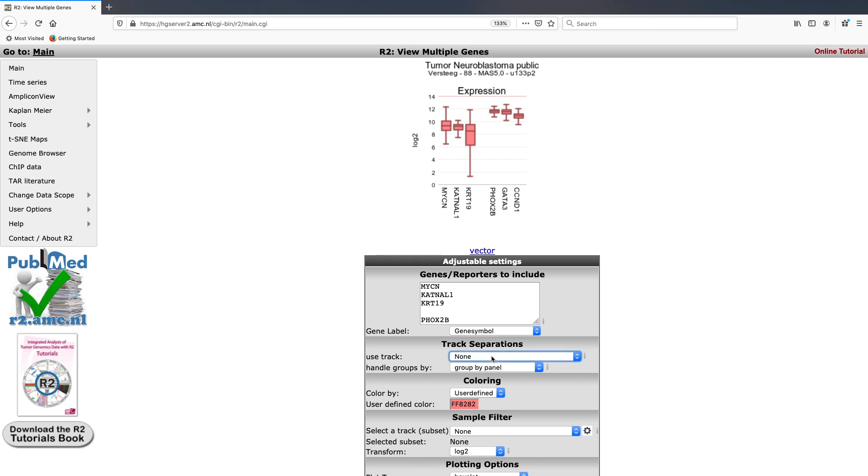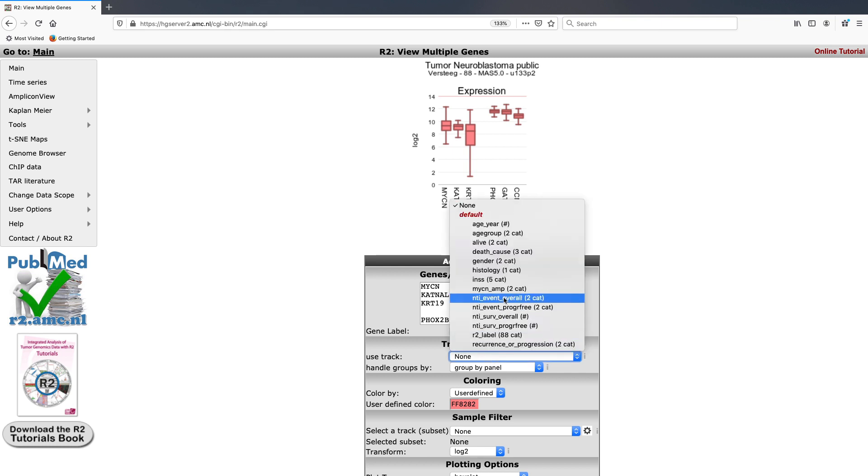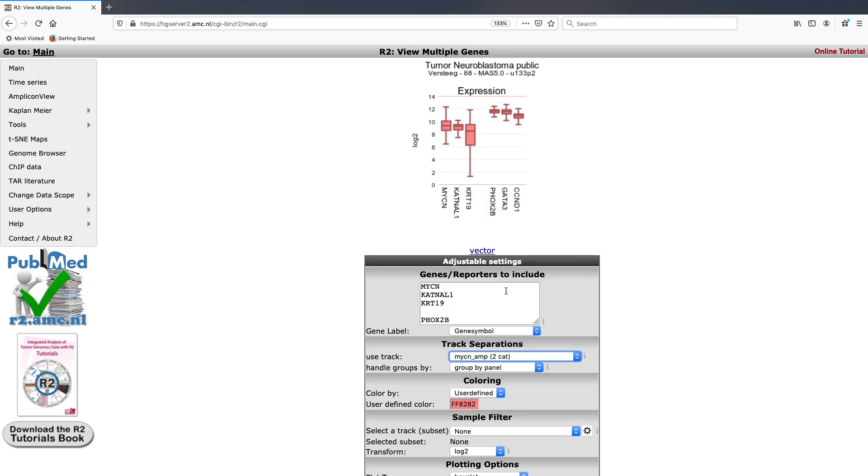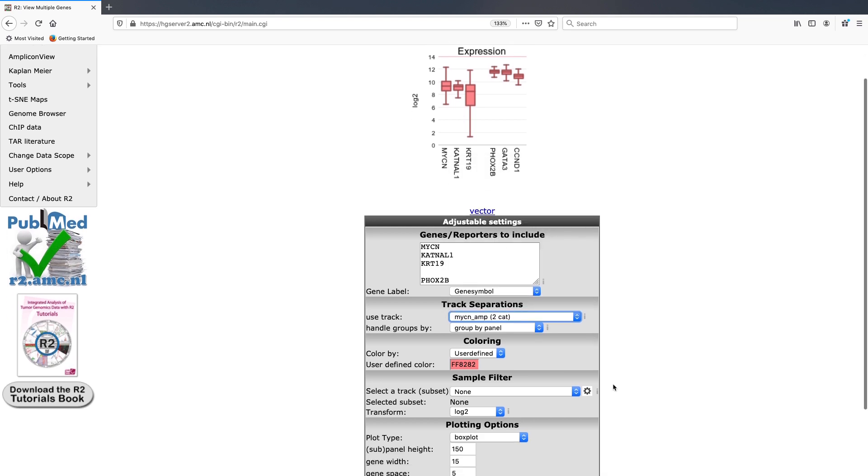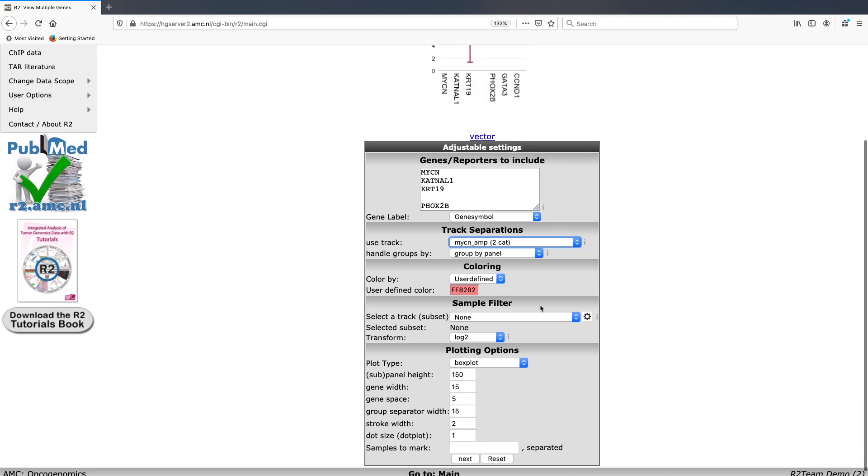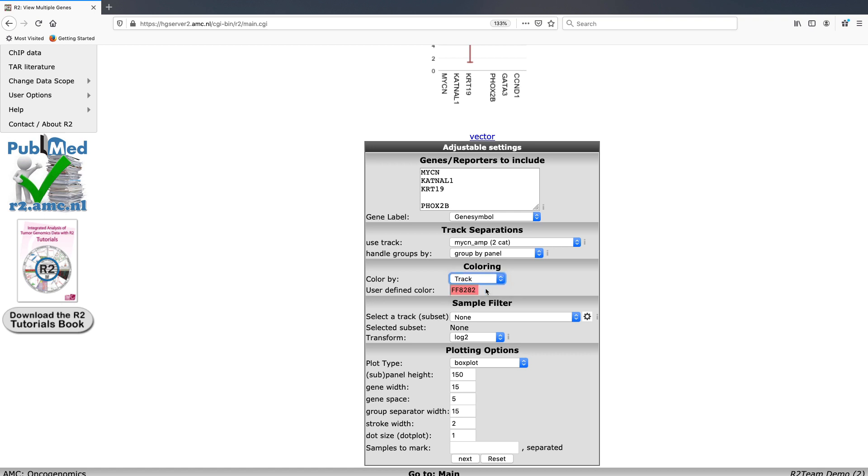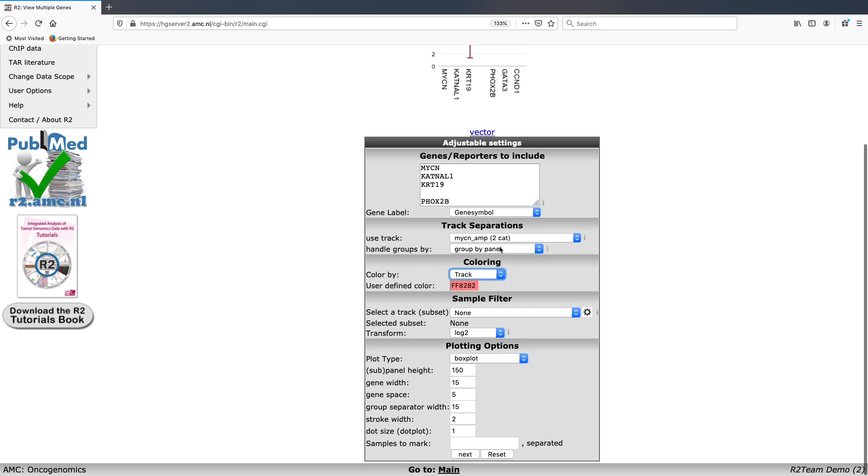For this example, we're going to look at splitting them up based on MYCN amplification. We can also then turn on coloring by track just so that each individual group within the track will be a different color. And we will now click next.